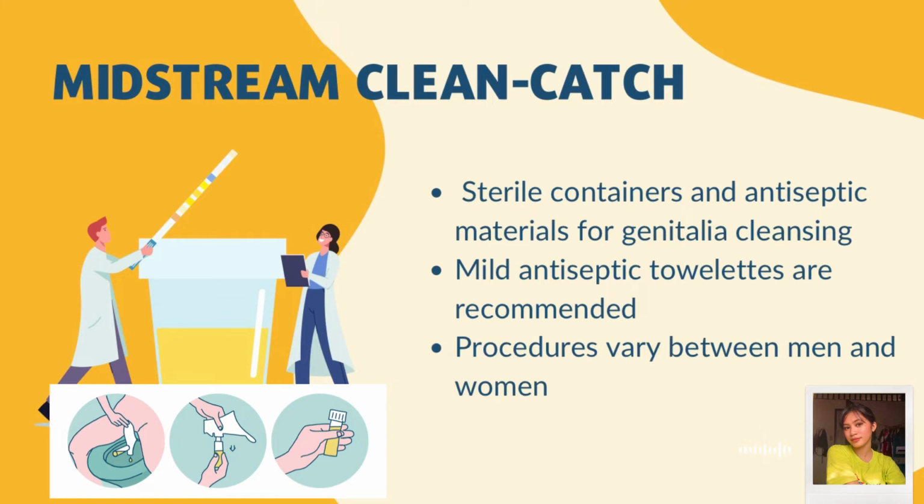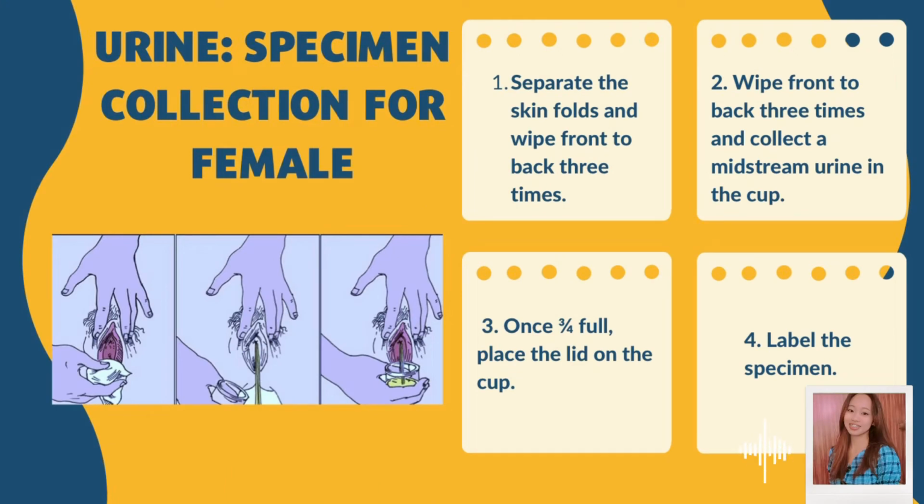The procedures for collecting a clean catch sample may vary slightly between men and women and are described on the following slides. Urine specimen collection for females for midstream clean catch specimen.